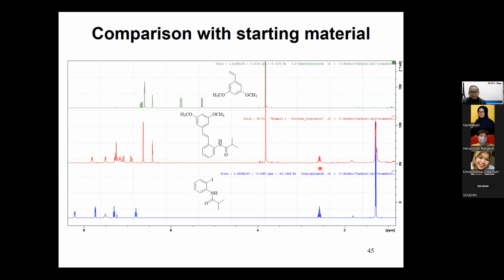Okay, for example, this peak is represented in these regions. So this region is already assigned for the protons. You can see this peak is the signal for these protons, for these positions. So it means the reaction happens. So you have to do more about this one. And what you can see here is the aromatic region. This is the aromatic region.